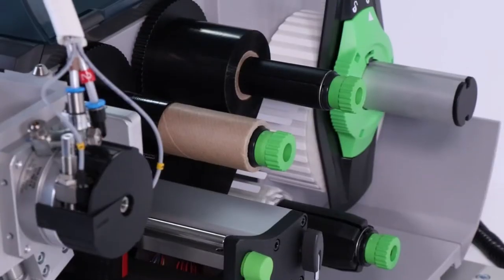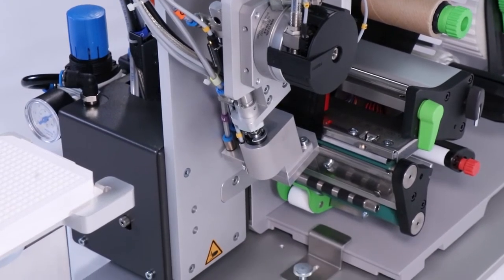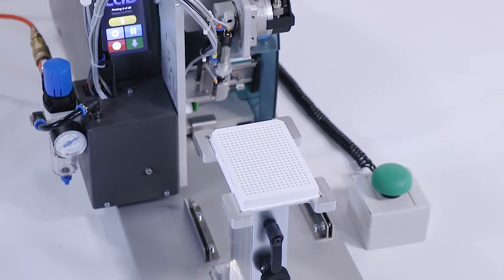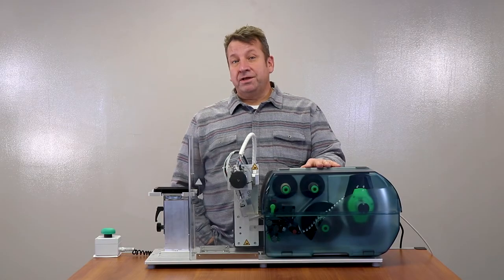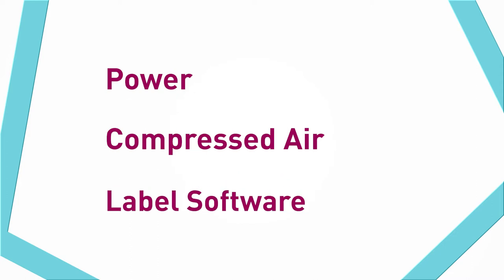Here we have a custom plate applicator that we made using the CAB Squix printer and the CAB S3200 applicator and a custom plate stand. All you need to get this going in your lab is power, compressed air, and a label software like NiceLabel.